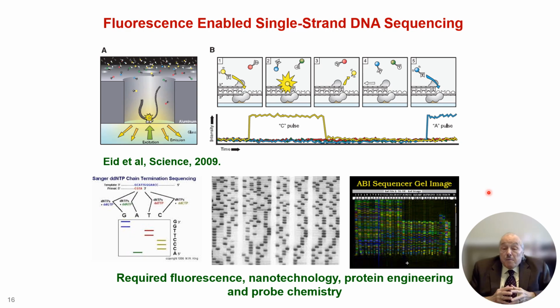This is one of the most remarkable things that has happened because of fluorescence. Way back in about the year 2000, the NIH decided that it wanted to find a way to measure the entire human genome. If you stretch the entire human genome out, and I've forgotten the exact number of base pairs, it's about 1 yard long, and it would be impossible to identify all of these bases.